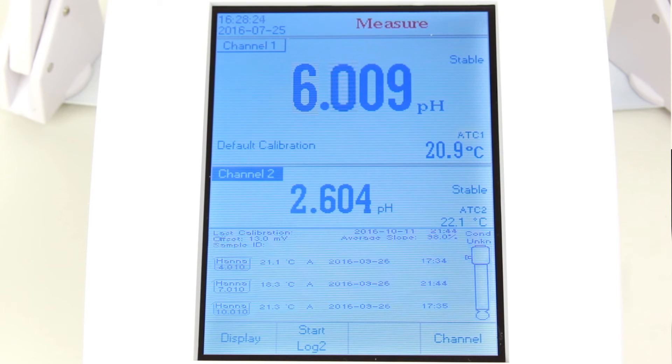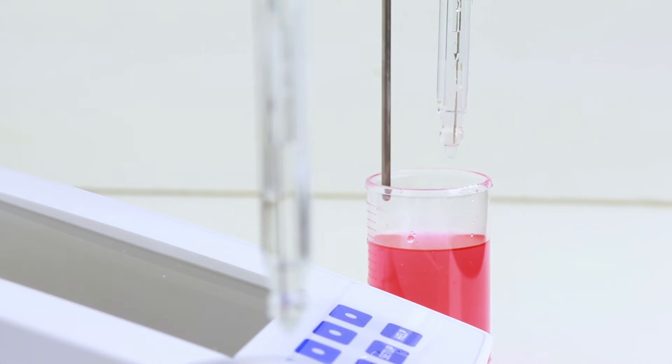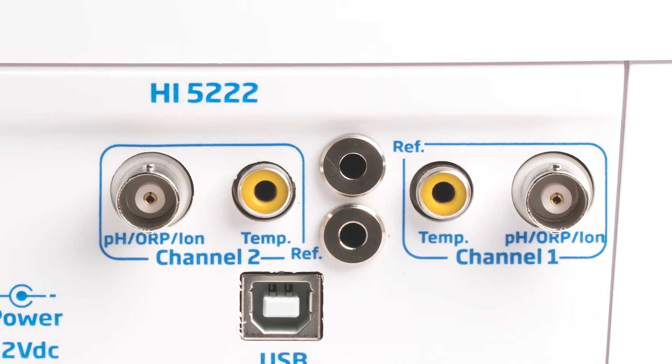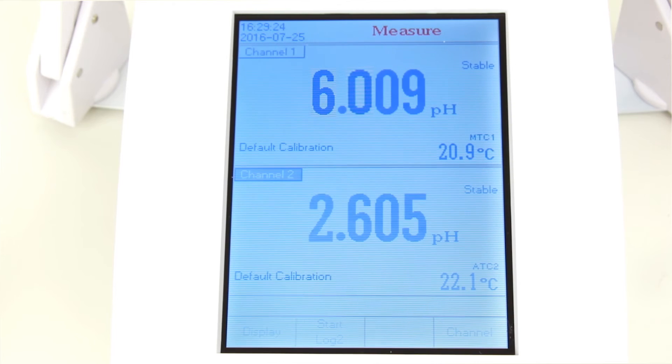The dual-channel operation of the meter is both powerful and easy to use. The HANA HI5222 has two input channels. The meter uses BNC connections, so our full library of PH, ORP, and ISEs are compatible. Making adjustments on each measurement channel is as easy as a push of a button. The dual-level display allows the meter to display both values for each measuring channel.